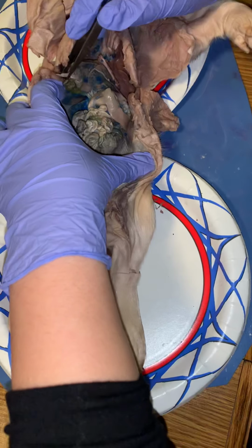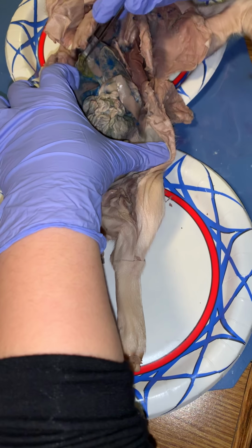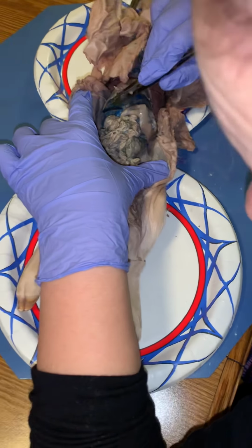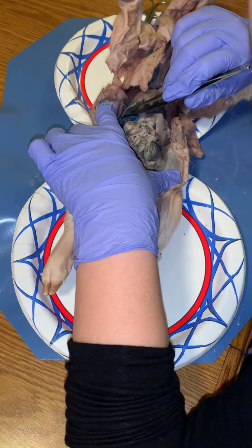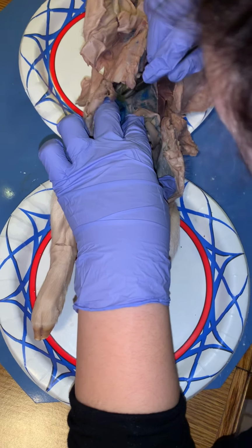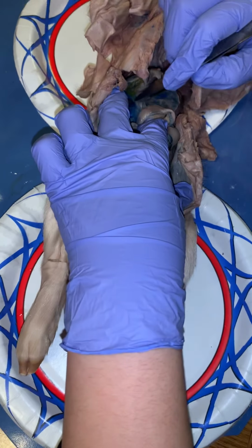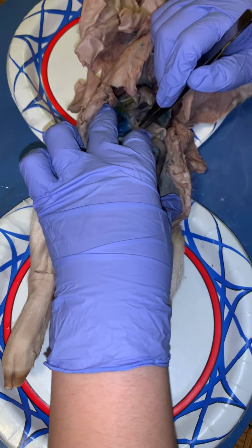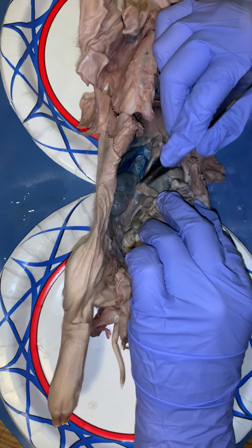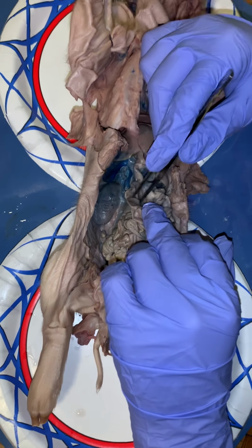And underneath of it, we have this little green sac here, and that's our gallbladder. It does seem like it's kind of flattened, so it was a little bit difficult to see at first. And then the gallbladder flows into the cystic duct and the common hepatic duct. So that's right here. And they join together to create this common bile duct right here. So now we're gonna move that empties into the duodenum, and that's this part of the intestines right here, the duodenum. It's kind of posterior in this pig, and the duct goes down there.